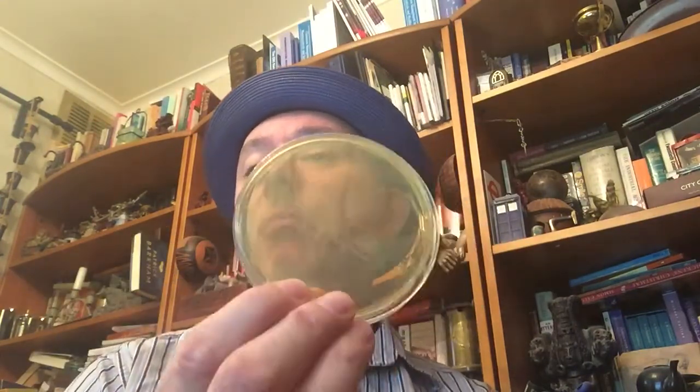The crucial element to this is the solid medium, and this is the case of the agar. The agar provides the solid base, and agar is derived from seaweed. For these types of agar plates, it's a red seaweed that's used to create the jelly-like medium and gives it the beige appearance. Agar has been around since the late 19th century, formed from the laboratory of a German bacteriologist called Robert Koch, who was a pioneer in research into tuberculosis.